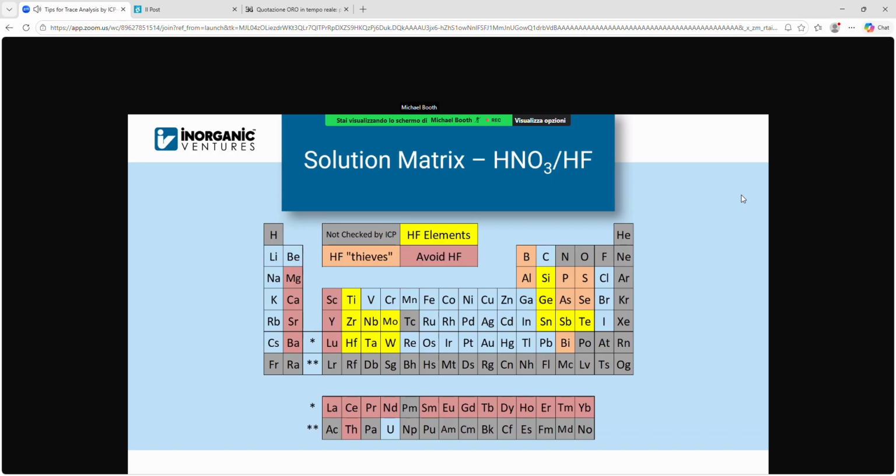It's because you might be introducing some of these high concentrations of elements that really require that, or not require, but have a strong affinity for hydrofluoric acid. So if your matrix, and you're trying to matrix match, has high concentrations of aluminum or phosphorus or sulfur, that you're just trying to get a good matrix match on, you may be unintentionally destabilizing some of the other elements because you're introducing an element that really pulls HF away from the ones that require it.